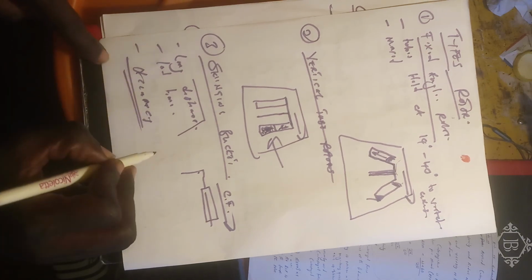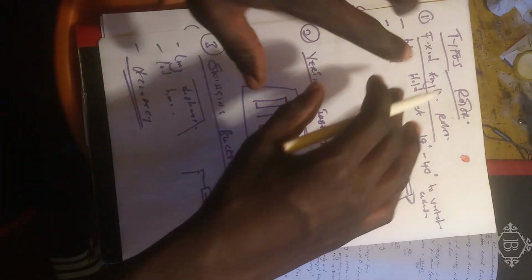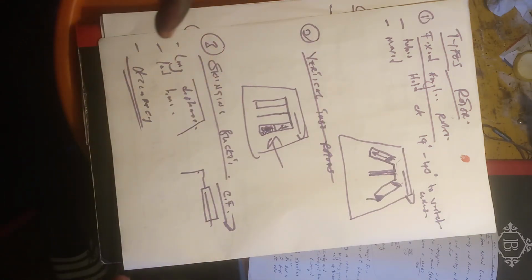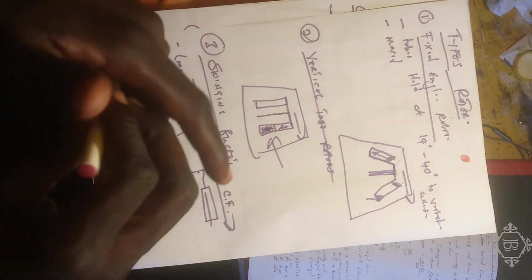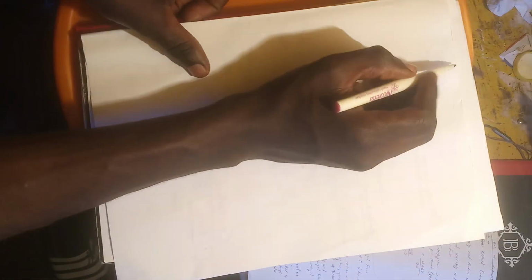So these are the three basic types of rotors that you have to remember: fixed angle, vertical tube, and swinging bucket. So just after understanding that, we can now look at the third part, which is the types of centrifuges.